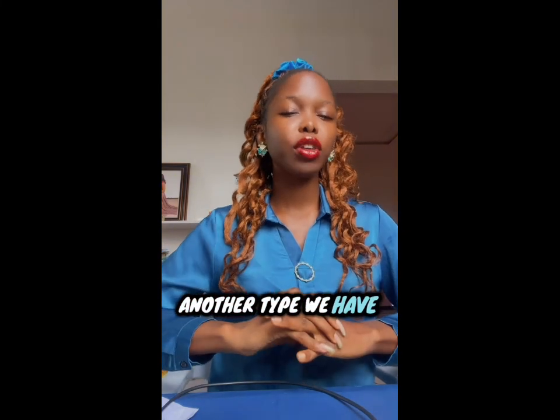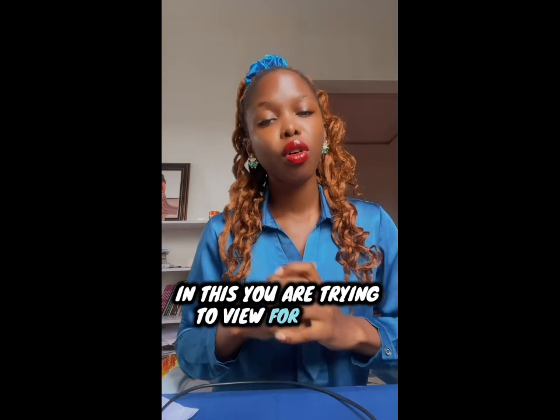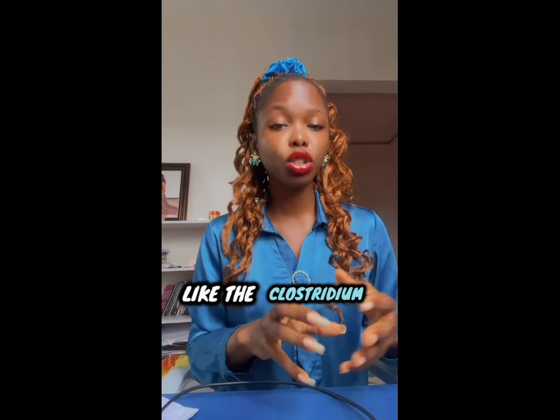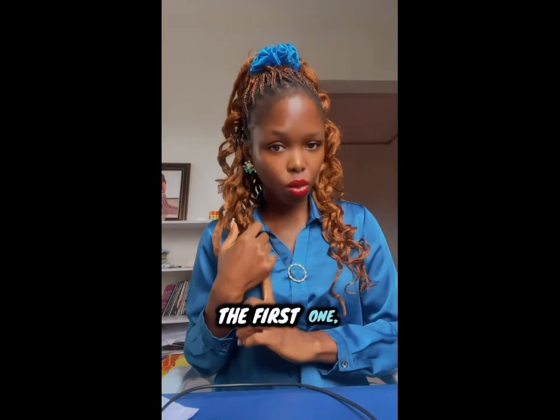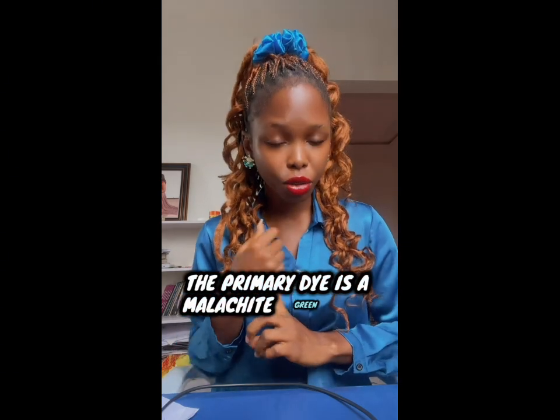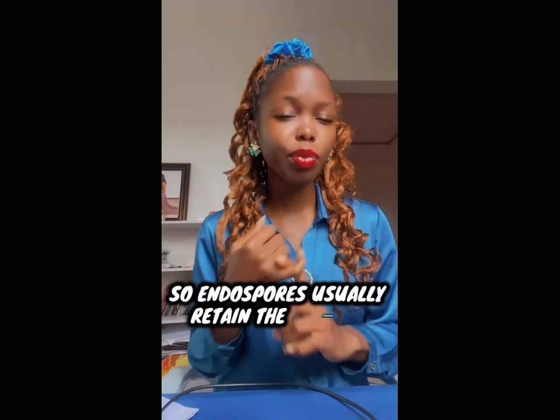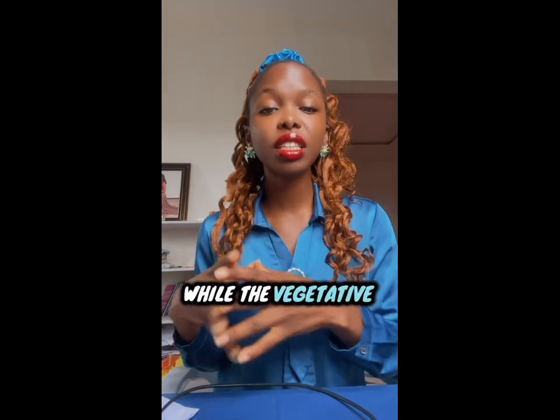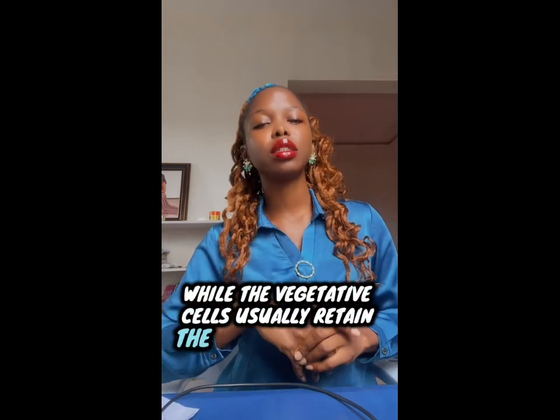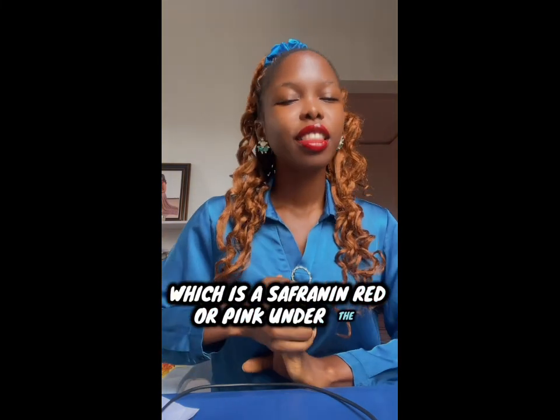Another type we have is the endospore stain. In this, you are trying to view spore-forming organisms like Clostridium species or Bacillus species. It's also a type of differential staining involving the use of two dyes. The primary dye is malachite green, and the secondary dye is safranin. So endospores usually retain the primary color, which is green, when you view them under the microscope, while the vegetative cells usually retain the secondary color, safranin, red or pink under the microscope.